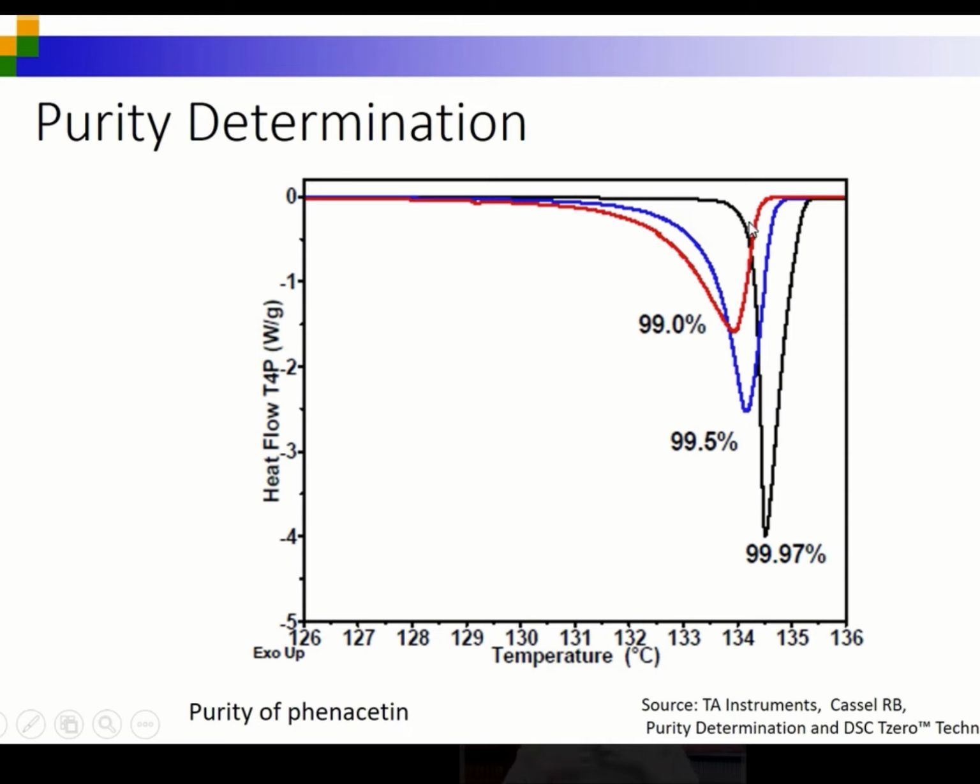I remember when I took organic chemistry, every time we made something, we had to look up the theoretical or the literature melting point of a compound, and then we had to report the melting point of our compound. Usually, our melting point would be lower than the literature version because we were organic chemistry students. We were not professionals, and so our compound would be lower. If we ever got a melting point that was higher than the literature value, we had to prove or explain why our compound was actually more pure than what the professionals got. And so every time you did a melting point, if you measured it and it came out higher, you kind of questioned yourself and you wanted to go back and redo it again because probably what happened is you did the melting point determination incorrectly.